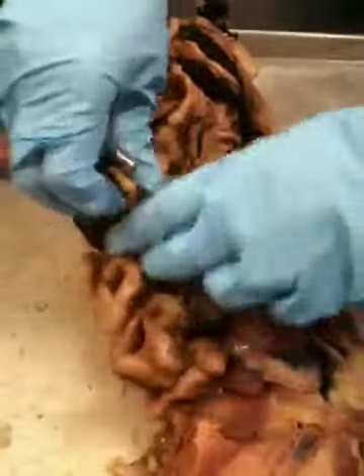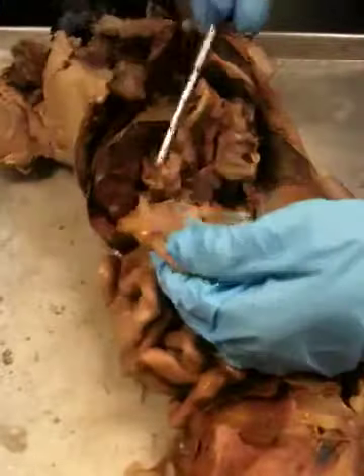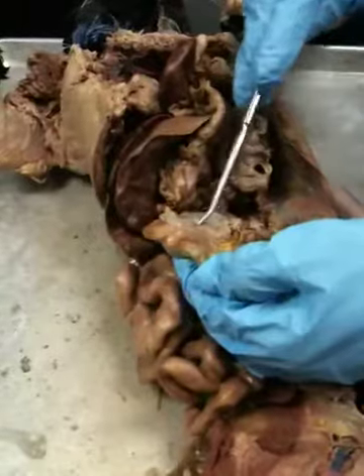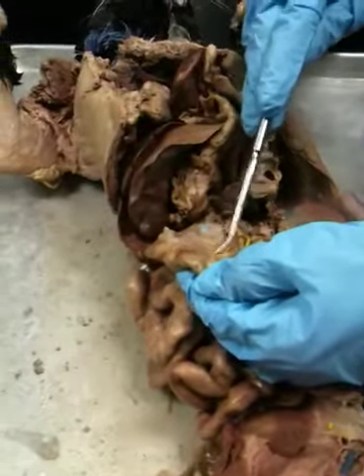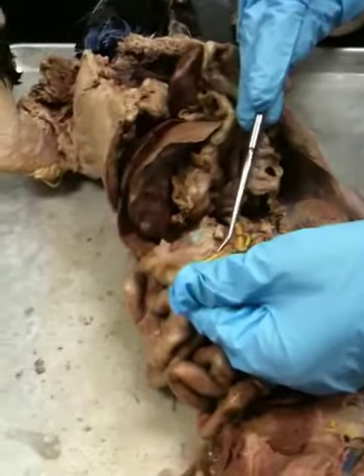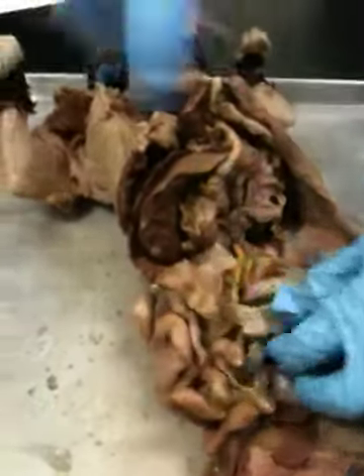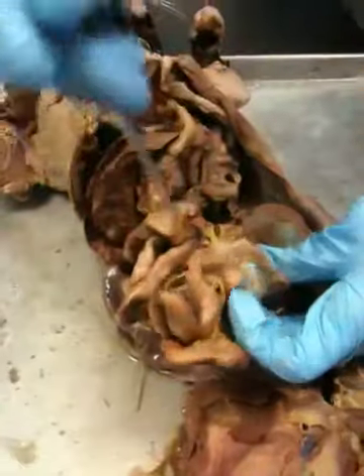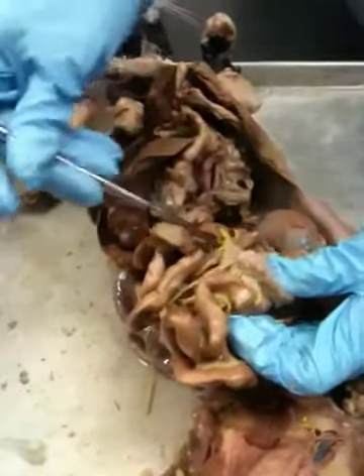All right, and then the yellow stuff. So you got one here. What is this thing? Is that the duodenum? And what is that thing? Pancreas. So what is that thing? Duodenal pancreatic? Pancreaticoduodenal is the name of the vessel. It's the yellow one here. Yeah, these are all veins. The yellows are. All right, and then we got one coming from the small intestine.